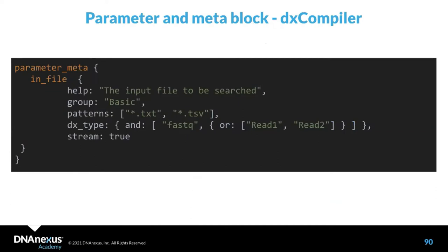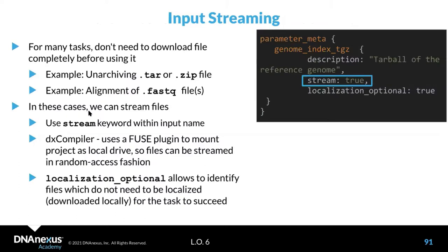We can also specify patterns in parameter meta. Regarding streaming: sometimes you don't need to download the file completely — you just want to read it and use it. For that, we can set the stream key with value true. Additionally, you can use localization_optional, a parameter that allows you to identify files which do not need to be downloaded locally for tasks to succeed, saving you money and time.